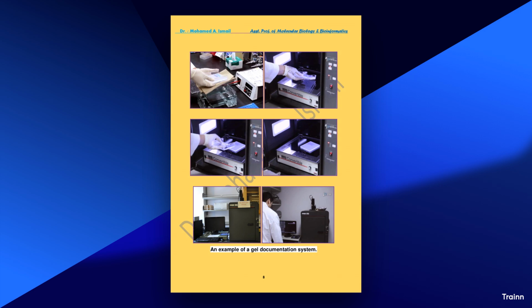Causes. Improper sample handling, inadequate separation or purification can lead to RNA contamination. Lack of RNase treatment: failure to treat samples with RNase can leave RNA intact. Solutions. Use RNase: treat samples with RNase to degrade RNA before PCR. Confirm DNA purity: use spectrophotometric methods to check for RNA contamination.